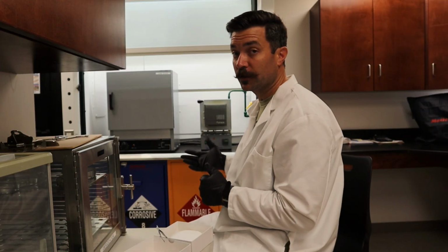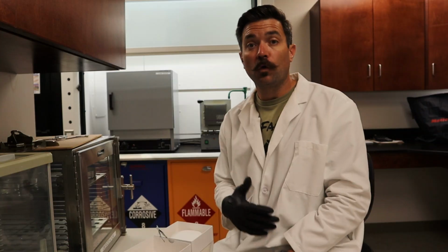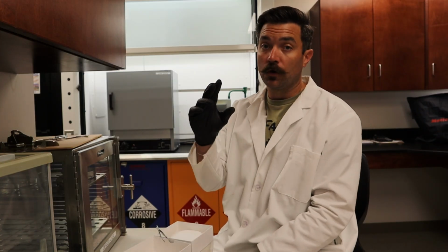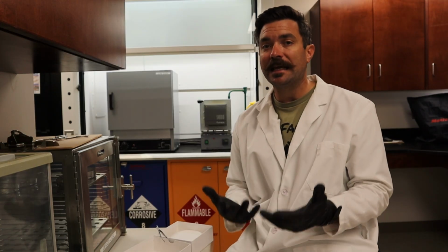Those two pieces of equipment are very essential for this test. They're very essential for the mixed liquor test as well as the mixed liquor volatile suspended solids test. Anytime you are testing for volatiles, whether it's your solids or your mixed liquor or whatever it may be, you have to have that muffle furnace, and we're going to explain why here in a second.